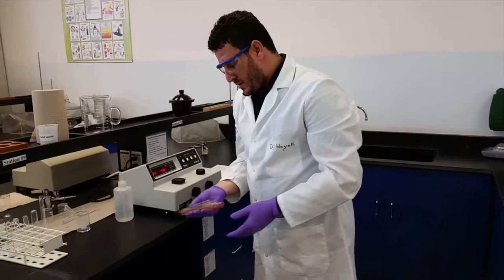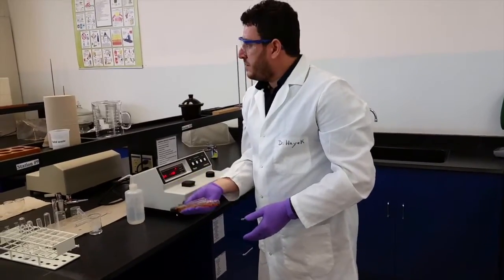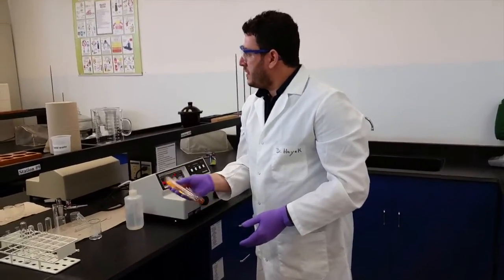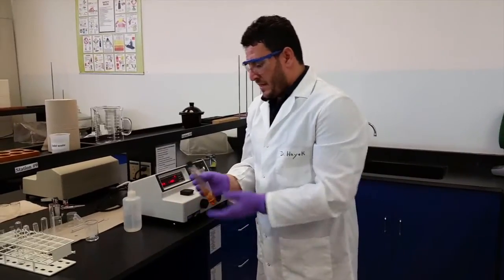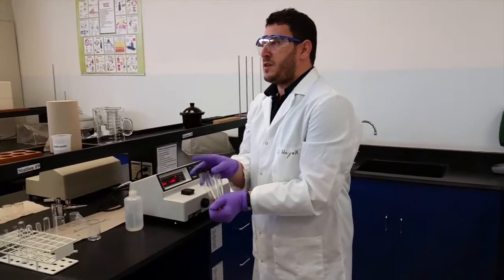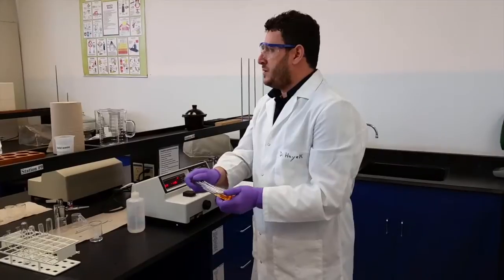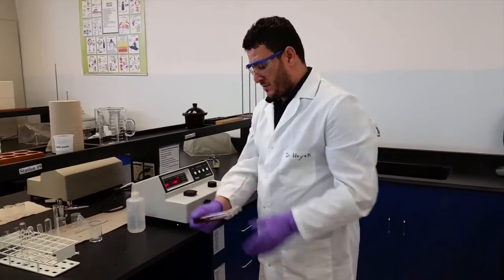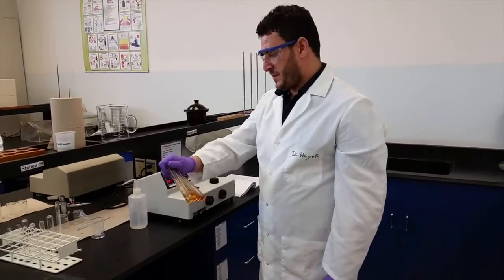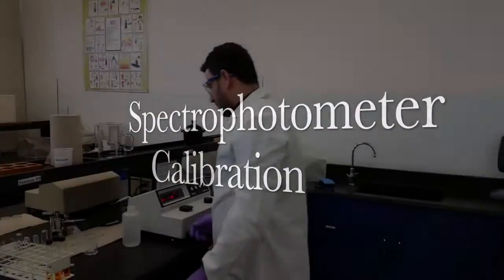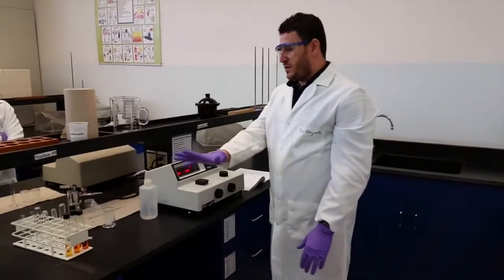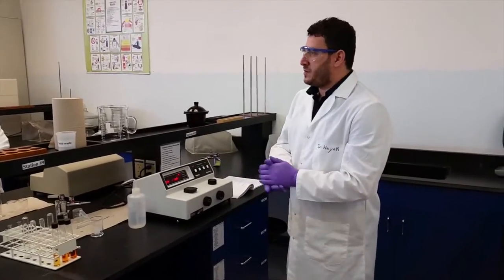I will just shake them to homogenize my mixture and give the reaction some time to reach equilibrium.